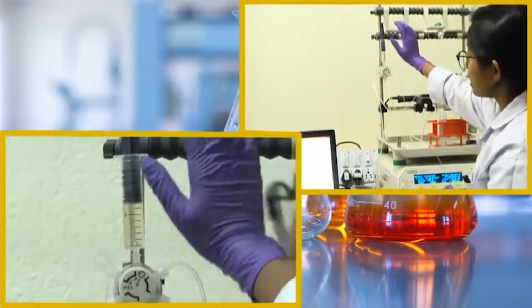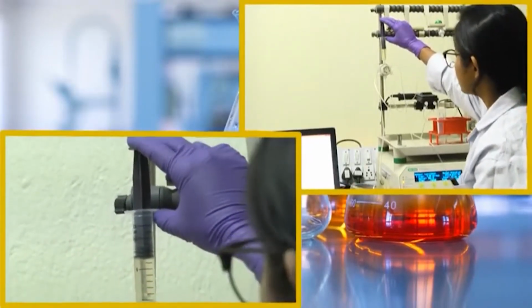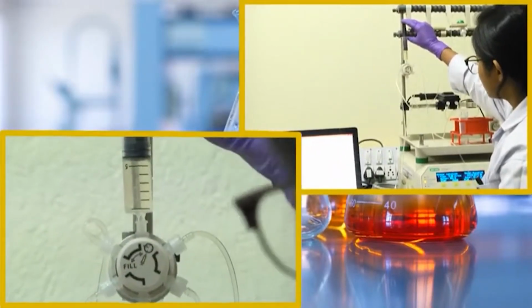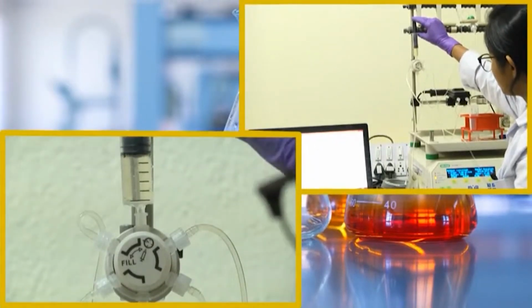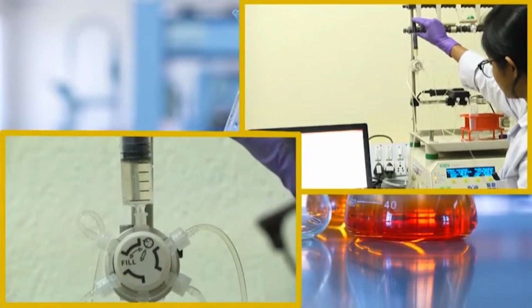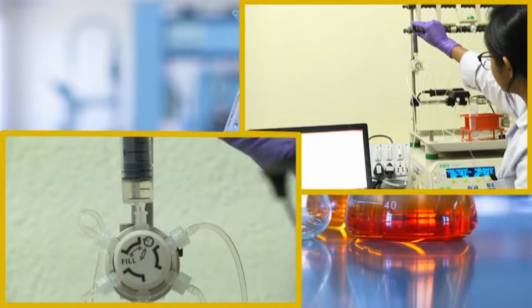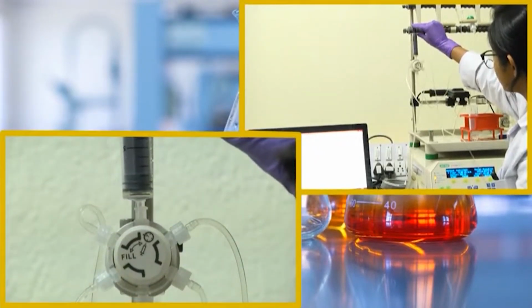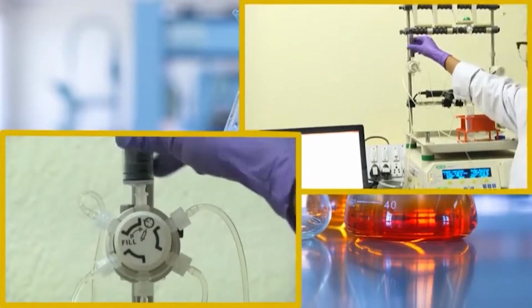Right now I have around 8 to 9 ml, so I can go for the full sample loading. I will just load the whole thing. So, gently start pushing this syringe. As I have less than 10 ml of sample, I can load it in one go.